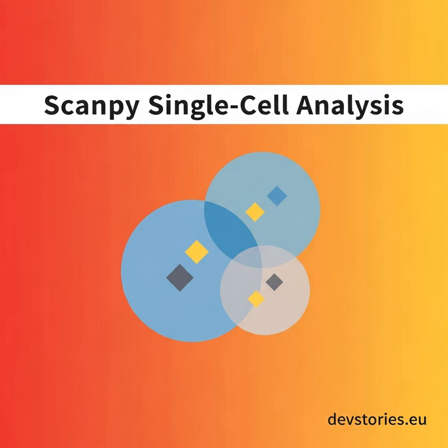Scanpy calculates the diffusion map and stores the new coordinates in the multi-dimensional observation attribute of your object under the key X_diffmap. The tool also stores the eigenvalues in the unstructured data attribute. These values tell you how much variance each diffusion component captures. A sharp drop in these eigenvalues indicates that you have captured the most important biological transitions, and the subsequent components are likely noise. In a typical differentiation dataset, the first non-trivial diffusion component directly aligns with the primary developmental time axis.